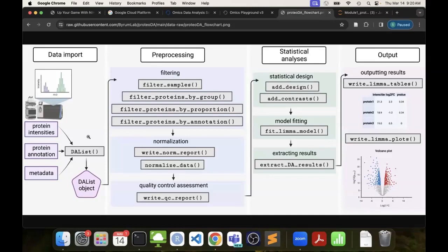If you have an error, it's more than likely going to be here, because something is messed up in one of the files. For example, if you're making a sample list on a Windows machine, sometimes they add blanks or spaces. No spaces in R. The other thing I see a lot, particularly when people are doing animal work, is that their animals are numbered, and R needs a letter.